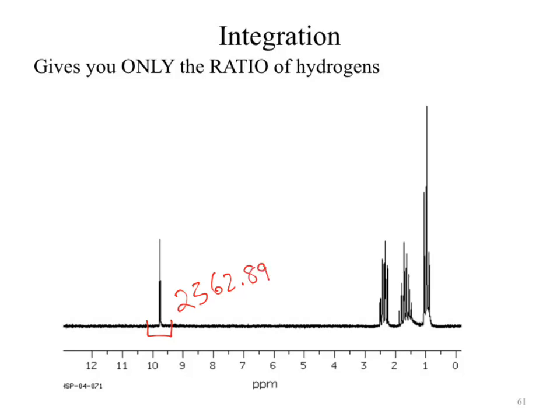Like, well, that's not very helpful. Okay, but then it'll also tell you the area underneath these. Oh man, I picked bad numbers. The area underneath that one is 4,713. Is that close enough? Yeah.